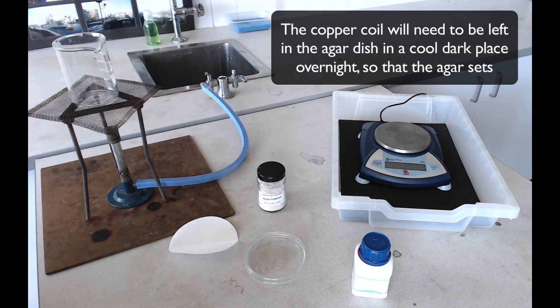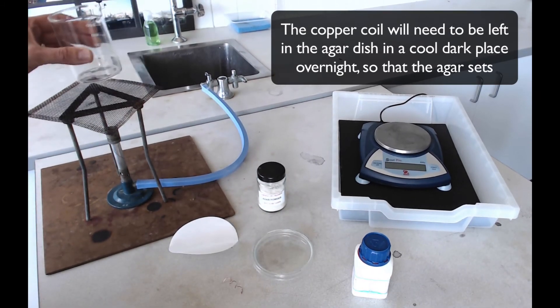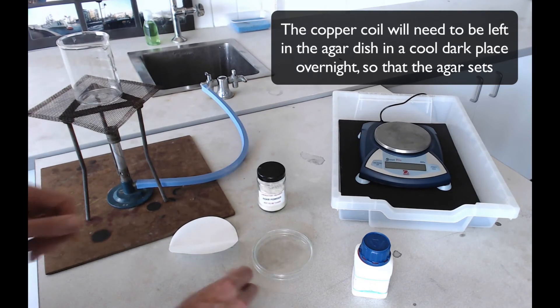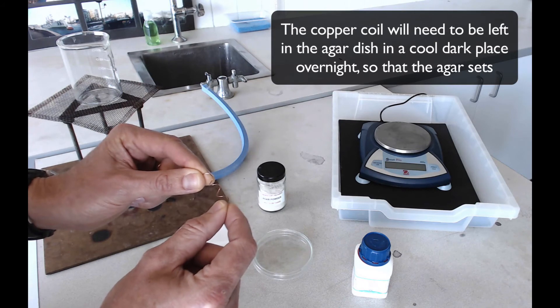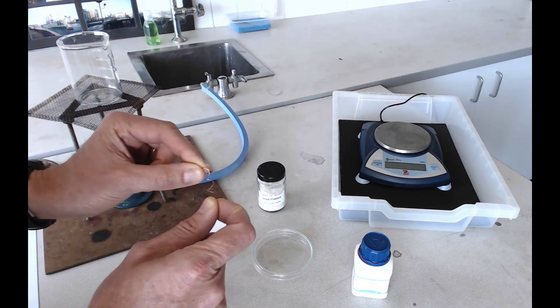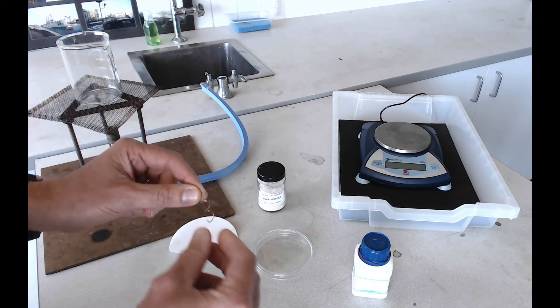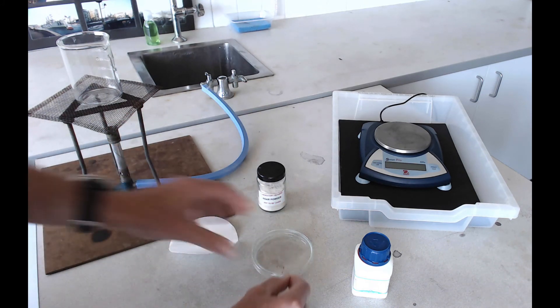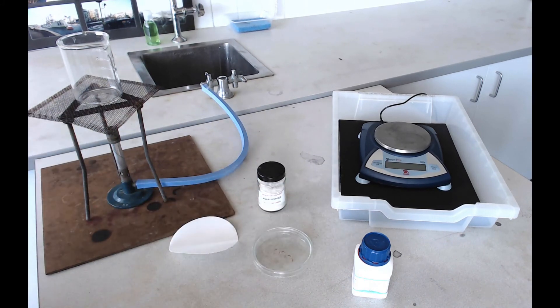Take your petri dish over to the cupboard and fill it with the agar solution, then put your coil of copper wire into that solution. You're going to need to coil the wire yourself — it's quite easy, just wrap it around a pencil and then pull it off. Put that coil of wire into your petri dish, put the lid on it, and leave your agar solution to solidify. Hopefully by the time you come back you'll have some nice crystals of silver growing on your copper.